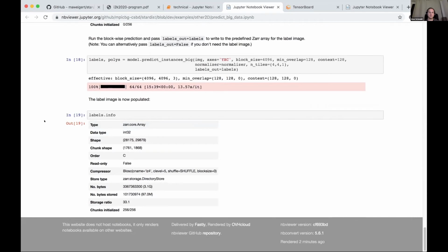Okay, I think this was all very quick, I know, but I'm happy to go into more detail if people are really interested in some of these things. Otherwise, I think it's important that you play with the stuff that interests you as well, and then we can help you if you have any questions with that. Okay, so I'm done. It was really nice to see what's under the hood and the things you can tweak.